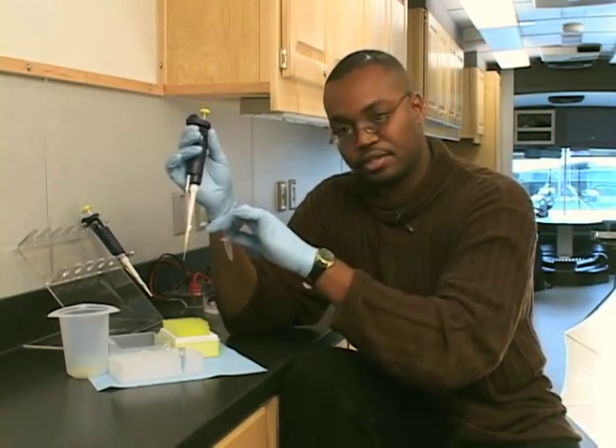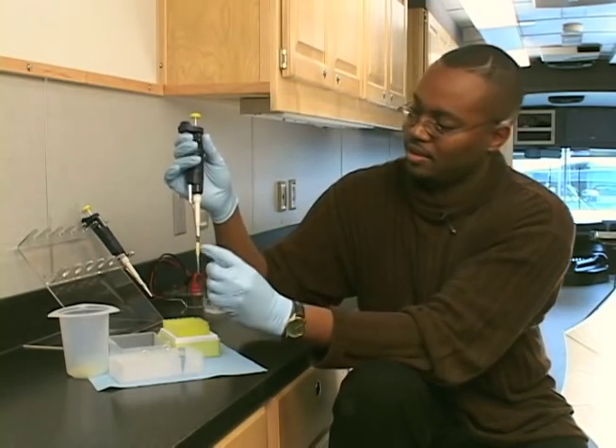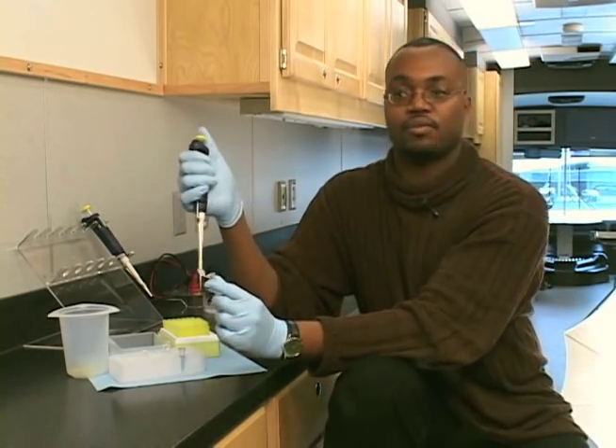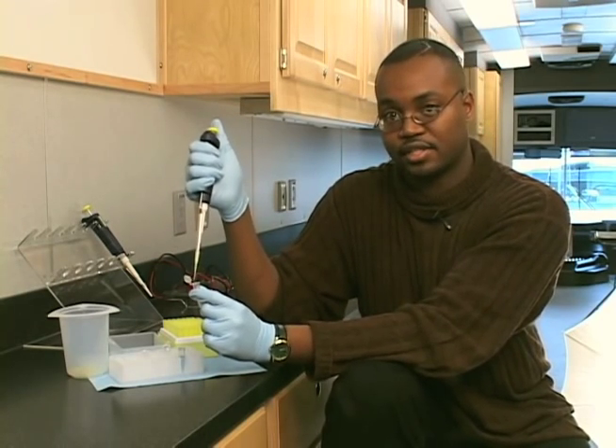Now I want to transfer this 20 microliters into this empty tube. As you can see, there's an empty tube here. I'll open up the lid. This is where you're going to use your thumb again, but this time we're not going to stop at the first friction stop. We're going to go all the way down to the second friction stop.